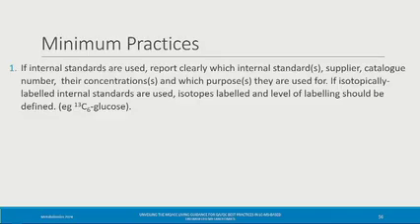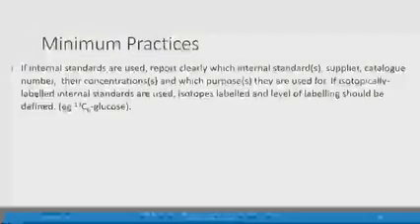Yeah, no, this is definitely a tricky point, and I think this is where the two communities diverge a little bit, but I think there is a pull also to understand better this choice of internal standard in lipidomics. So yeah, excellent point. Thank you. Great, so I think we'll stop here in the interest of time, but if you have more comments on this, come find us after the workshop and at the coffee break.